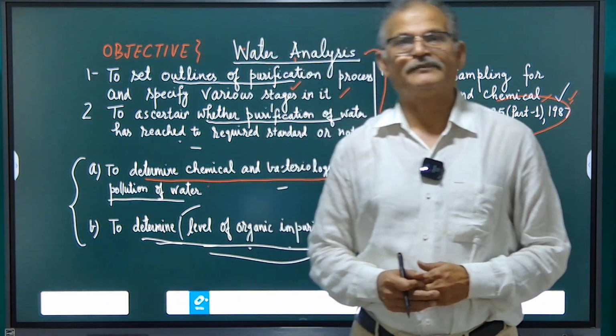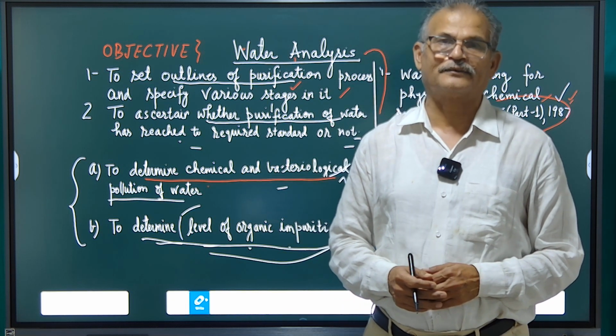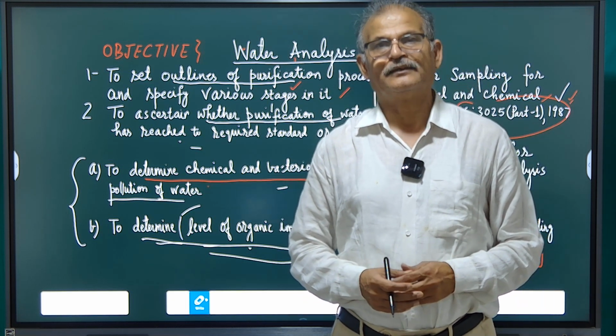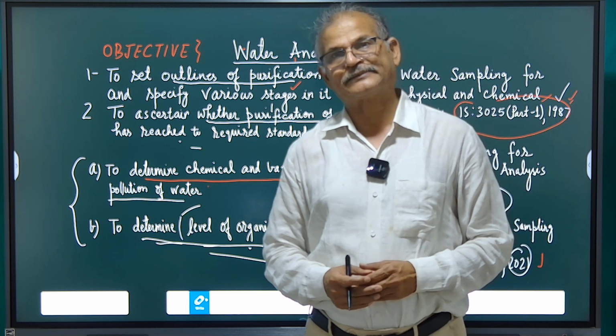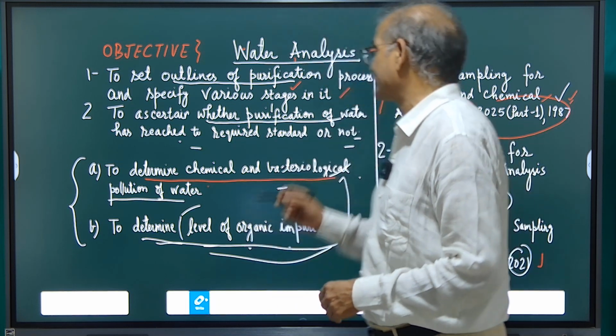Today in this lecture we will be studying about water analysis. We know that water available in nature has a lot of impurities. These impurities are checked by doing the water analysis. We do the physical examination of water, chemical examination and microbiological examination.